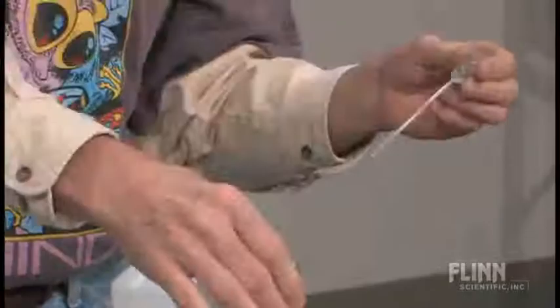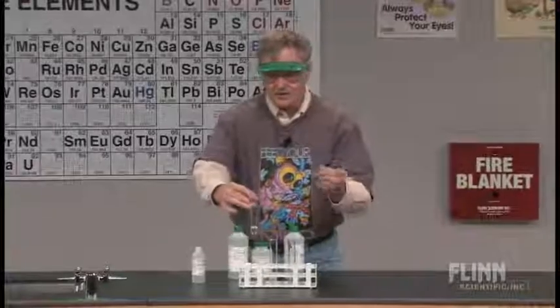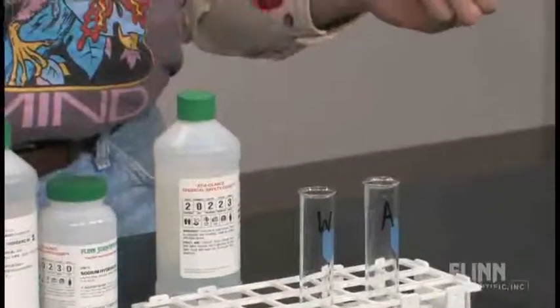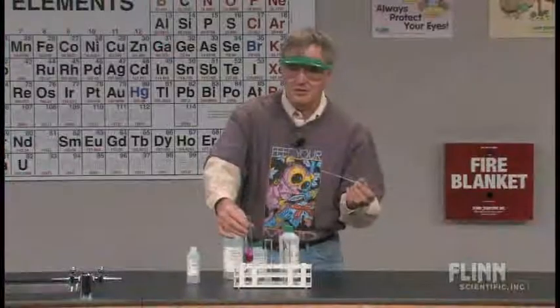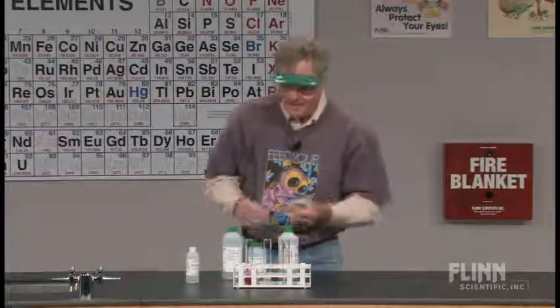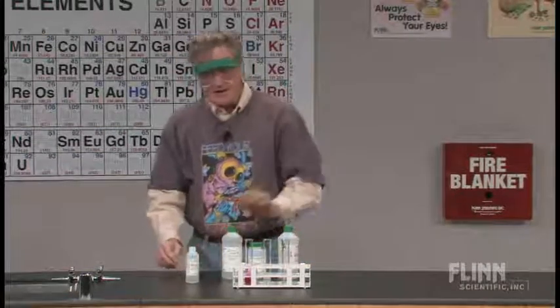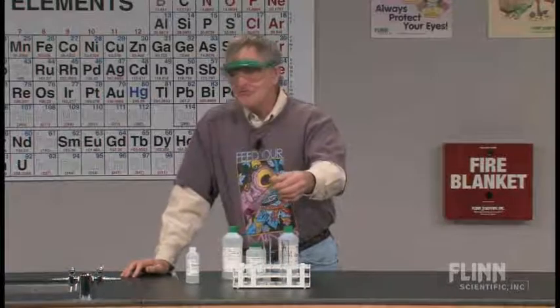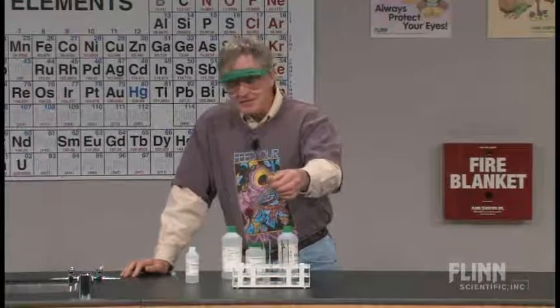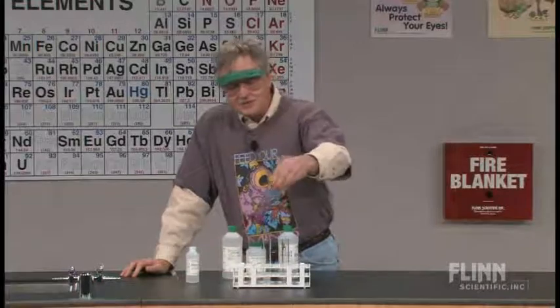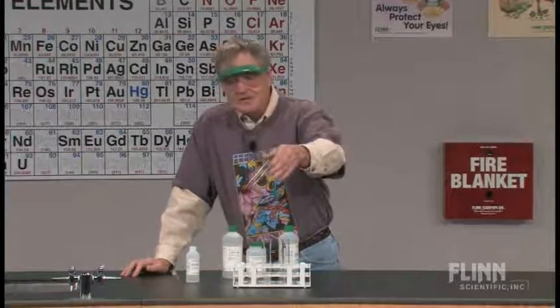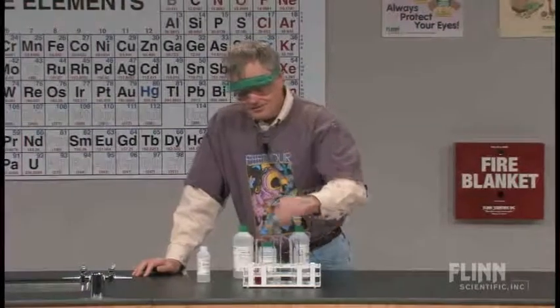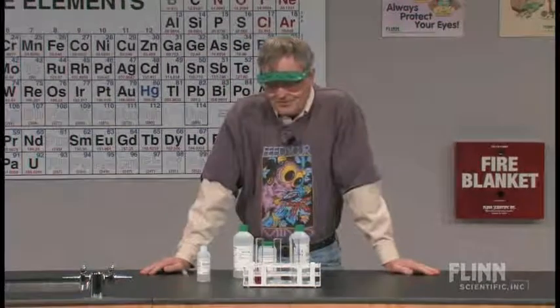Now I'm going to drop it in the water, and we should see that same cloudiness appearing but no appreciable color change. Then a few drops of phenolphthalein into the base — and as you can see, we get a nice pink to almost red color. The more you put in, the darker the color. Now that's kind of neat, and this in itself is really cool.